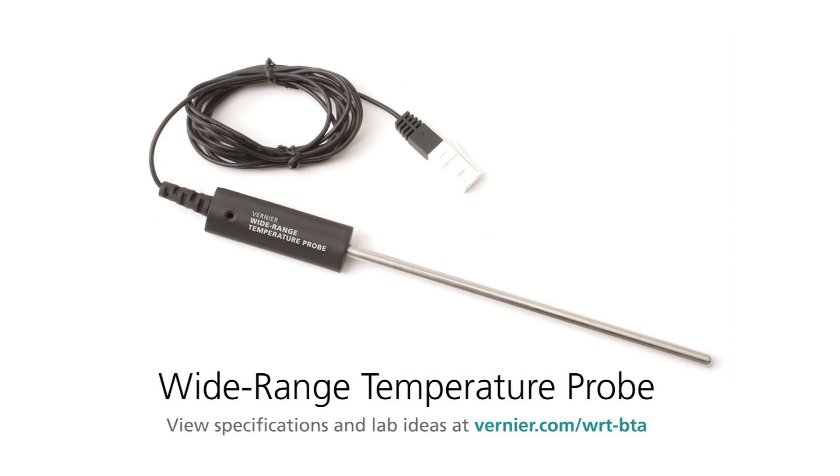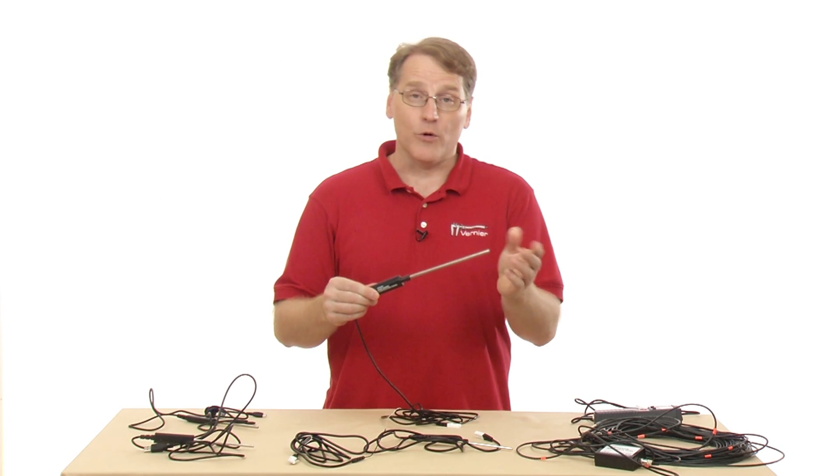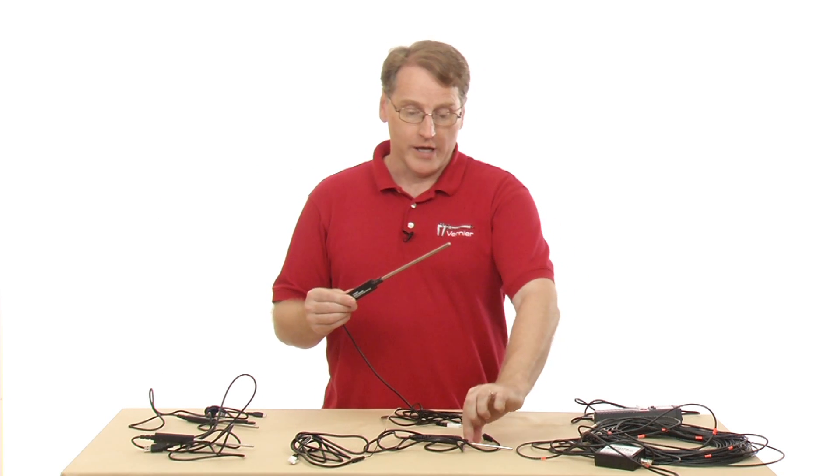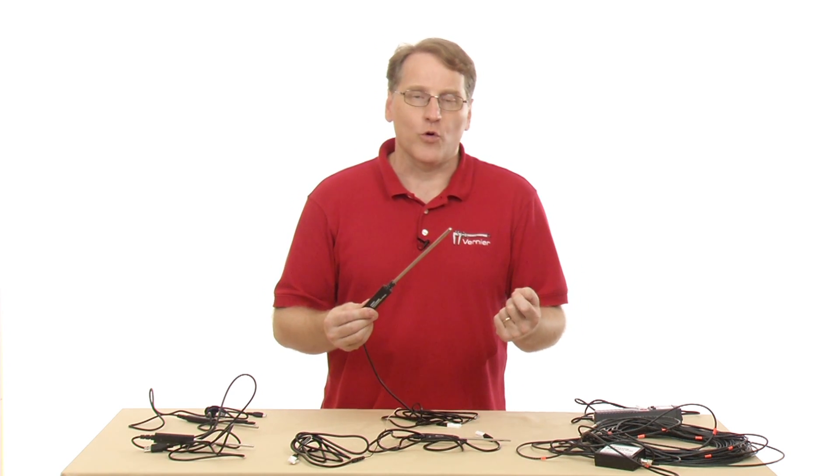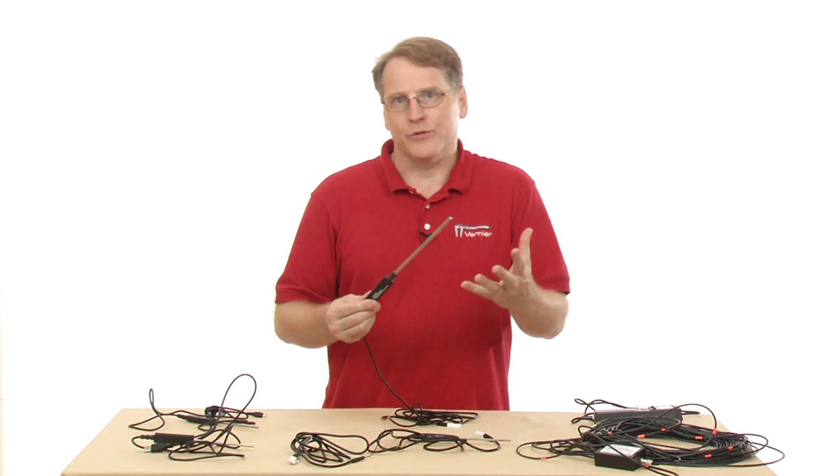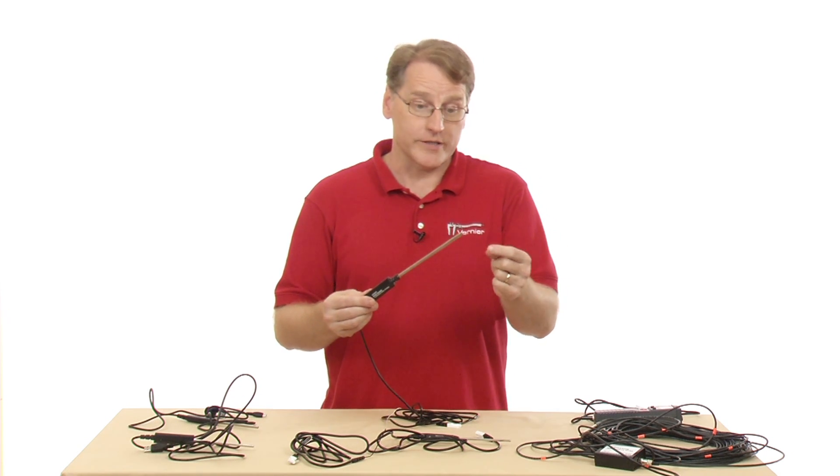Next is the wide range temperature probe, and the key feature with this one is the fact that it can go to a higher temperature than our stainless steel temperature probe. So the idea is that you might be using this in an organic lab, and you need to go up to temperatures as high as 330 degrees Celsius.